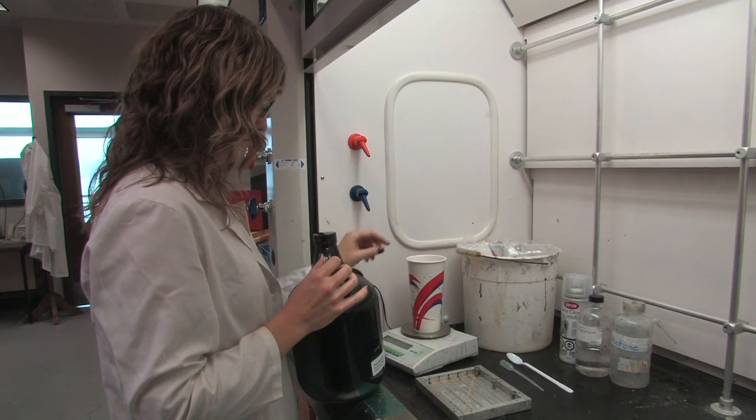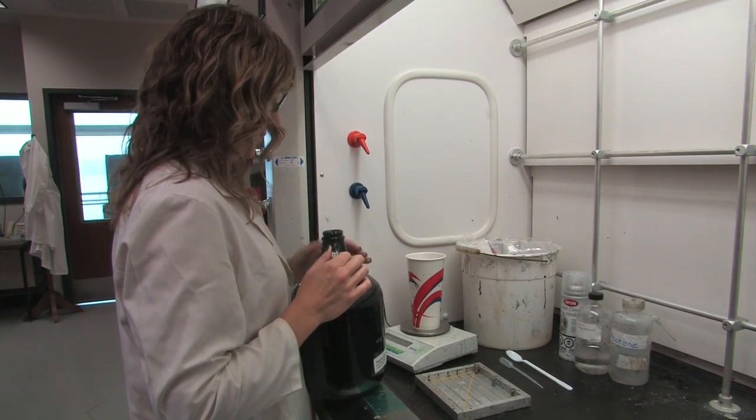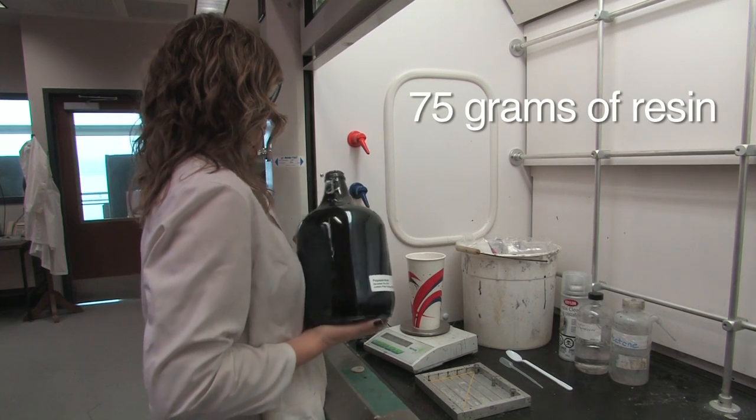Place a plastic cup on the scale and tare the scale. In this exercise, we are making one tray, so we use 75 grams of epoxy.